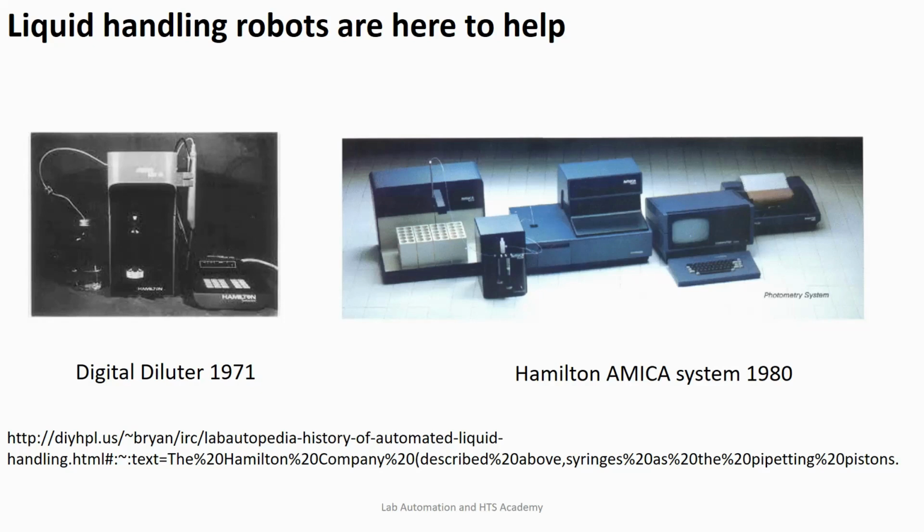But these days you would see that we can do much, much more. But everything started with this idea to mechanize the whole pipetting process.